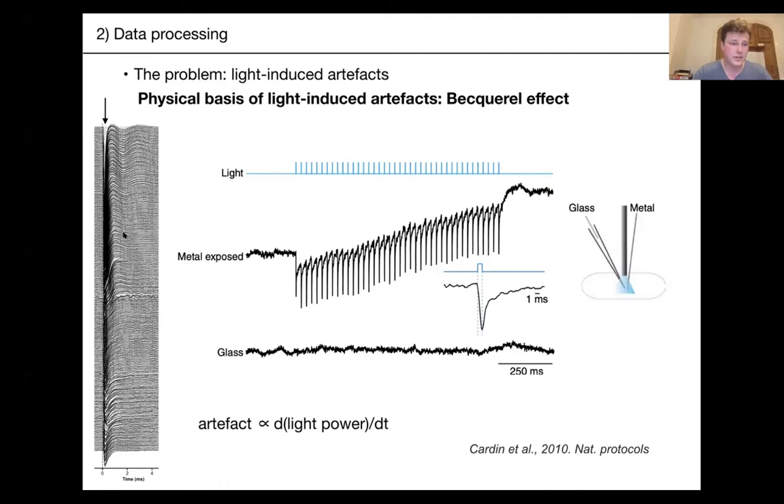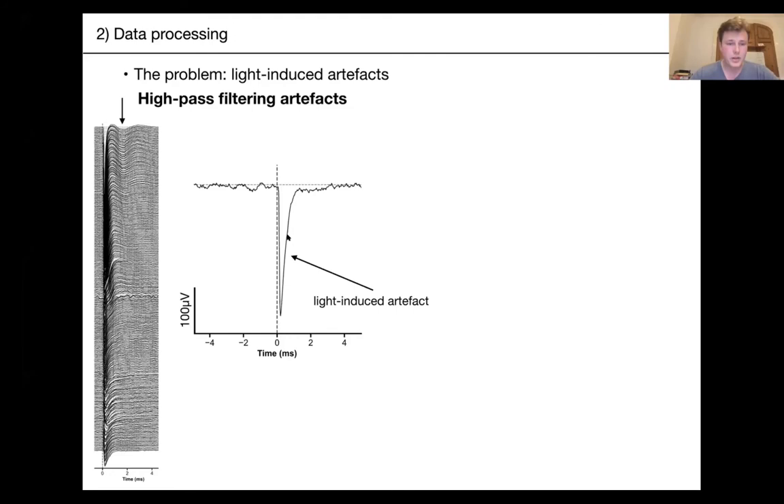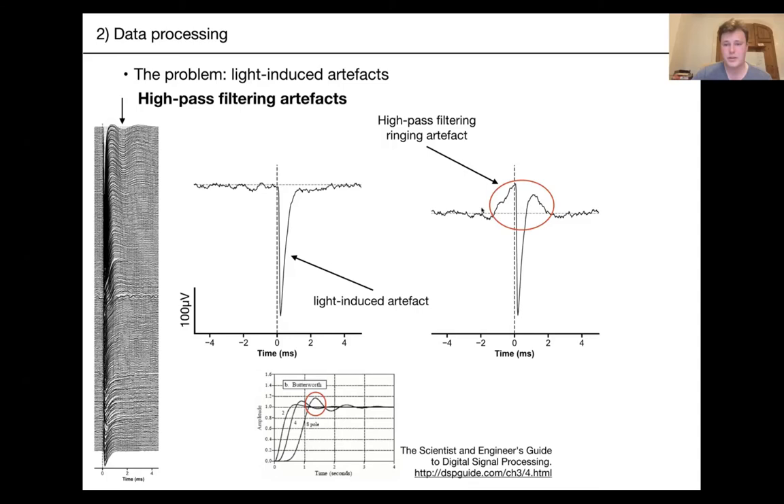The second epoch of the artifact is the ringing you see after the onset — that's caused by high-pass filtering. Here you can see the pure light-induced artifact on the raw trace; once you apply a high-pass filter, bumps appear on either side. This is due to digital filtering happening in both directions — past and future — and is caused by steep cutoff frequencies in filters like Butterworth, which create ringing artifacts around fast voltage deflections.